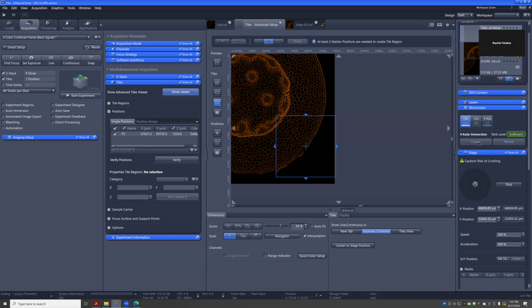That's better than people constantly switching, because then it's going to happen where someone images something on the oil setting with water, and then they're like, it doesn't look as good as it looked before. Yep. So we'll set it to water and we'll program it to water. I think that's the best solution.